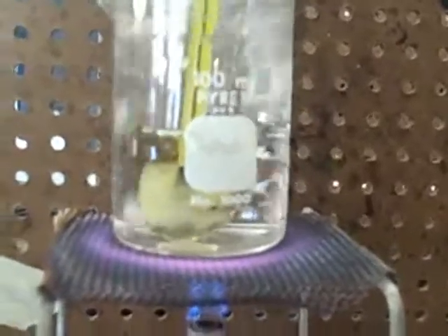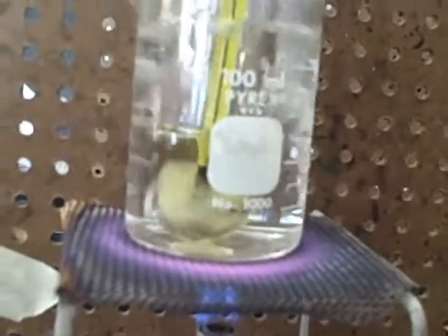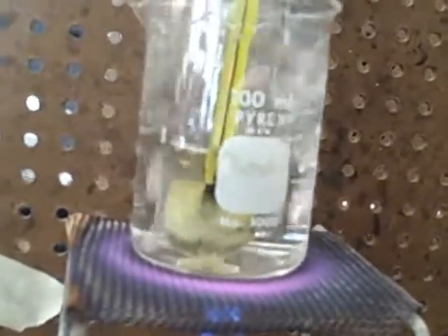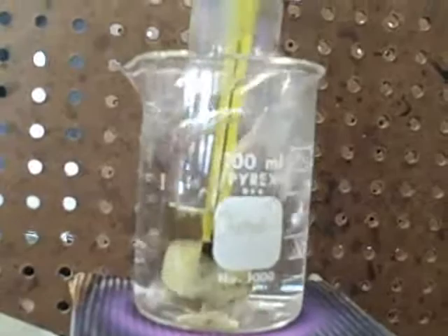Record the molten substance just as it begins to solidify. Continue to take readings every half minute until the temperature of the substance drops to about 65 degrees Celsius. Stop stirring the test tube when the thermometer is no longer free to move. So we wait until it's completed.